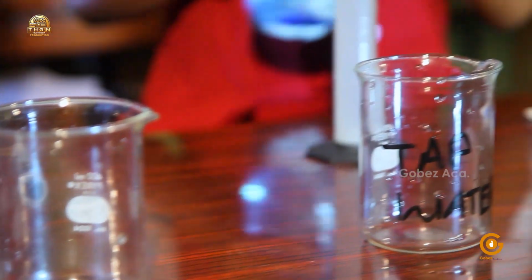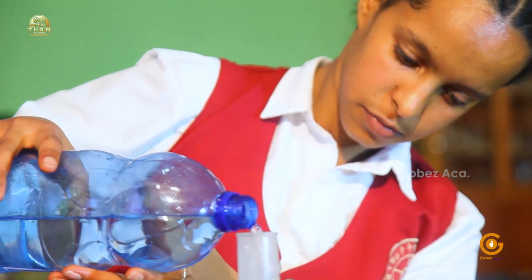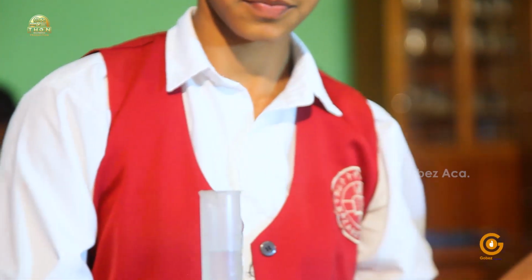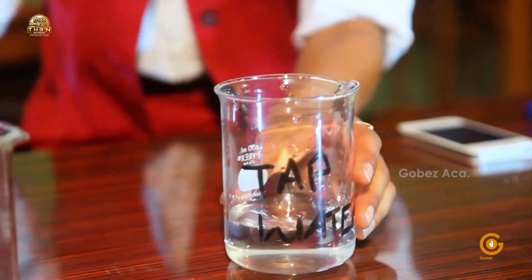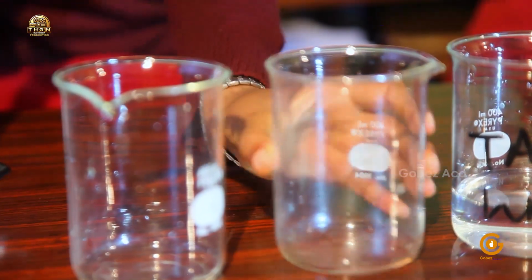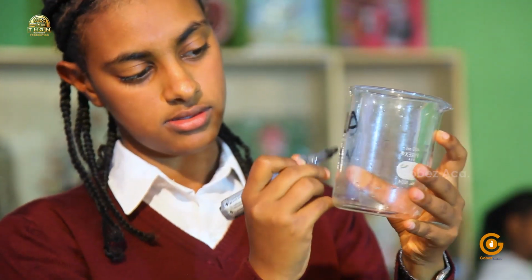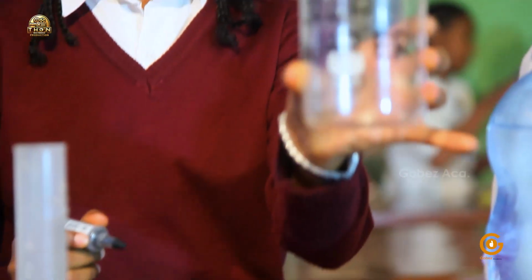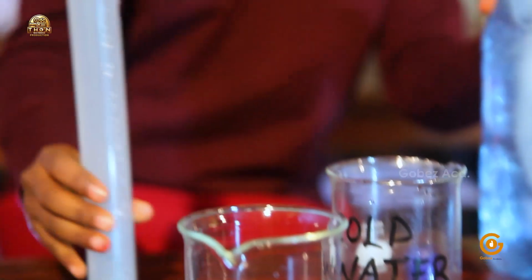And I put water from the tap into it. On the second beaker, I write cold water on it. And put into it water from the fridge.